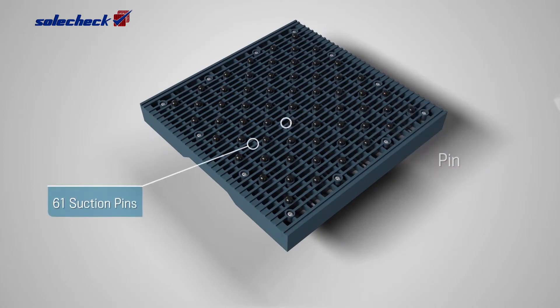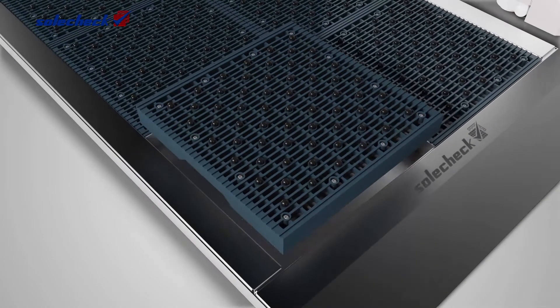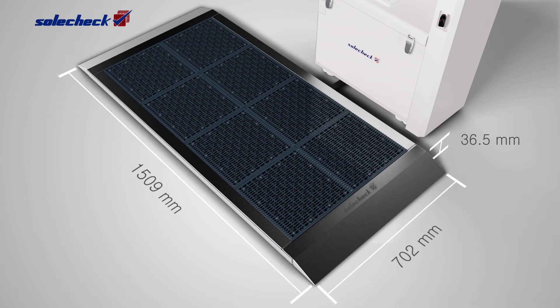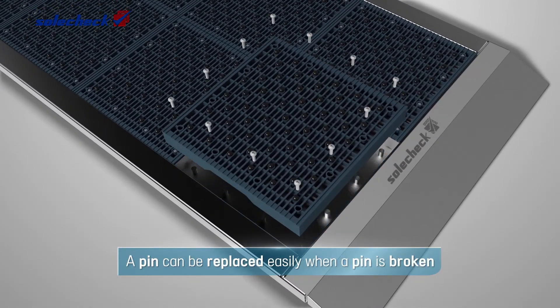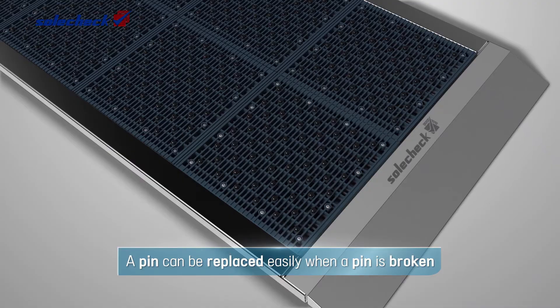SolCheck with improved suction rate with 61 suction pins. As it is a modular cell, the installation is expandable and can be managed conveniently. Located on the inner plate, it is easily replaceable by anyone in case of damage, even one suction pin.